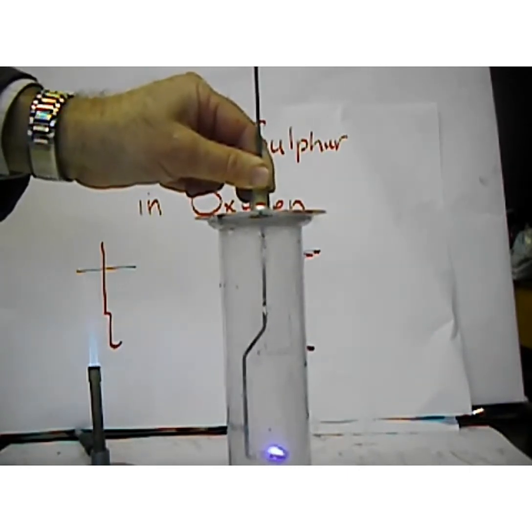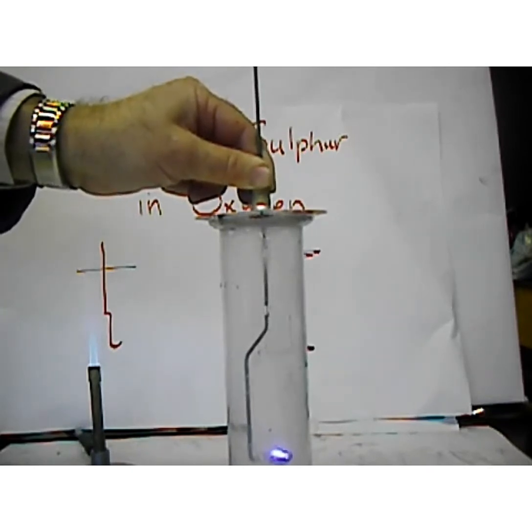Do I have some UI indicator paper there? Yeah.